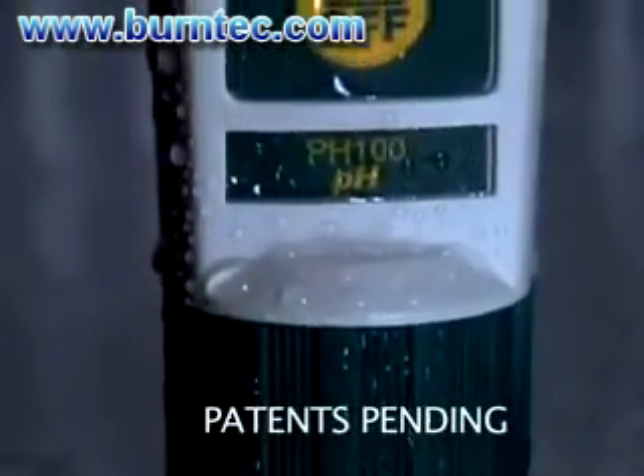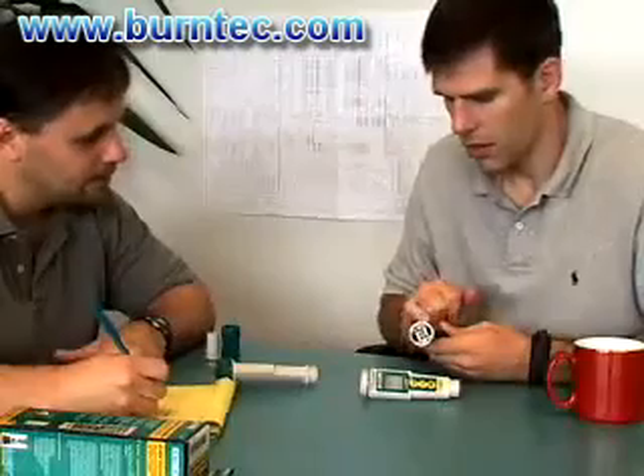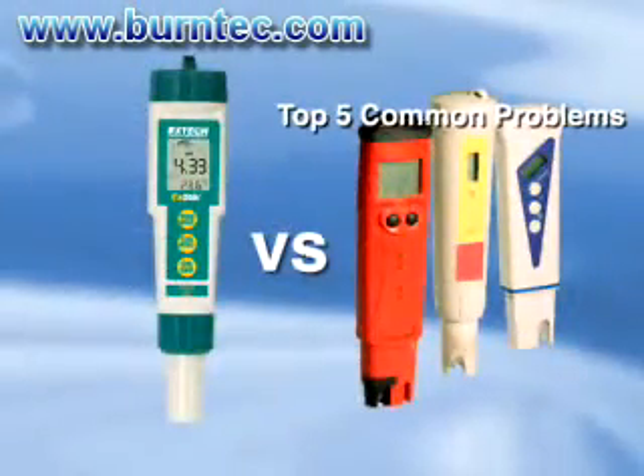Introducing the waterproof ExDIC pH meters designed with innovation in mind. ExTech design engineers have developed the ExDIC pH meters to offer solutions to the typical problems you face while using an ordinary pH tester. We will offer solutions to solve the top five problems a pH tester frequently faces.